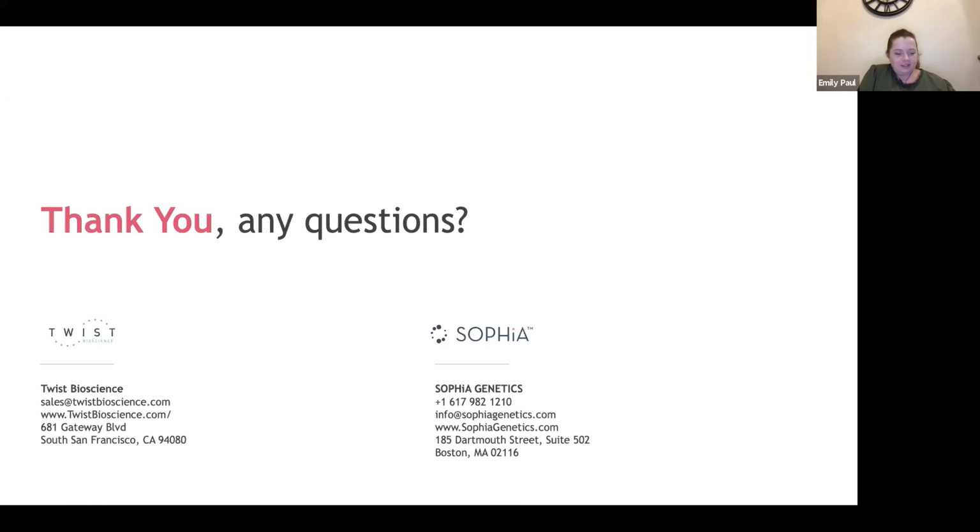Yeah, absolutely. Chime in about the probe design, but I'll speak bioinformatically that we're able to detect inversions like the Boland, ever so popular in hereditary cancer testing, because we're able to look at qualified and known breakpoints for that particular mutation. So I would say one of the limitations is, in fact, having identified breakpoints. And of course, positive controls are always nice to help. But there are some known positive Bolands where we've been able to detect them.